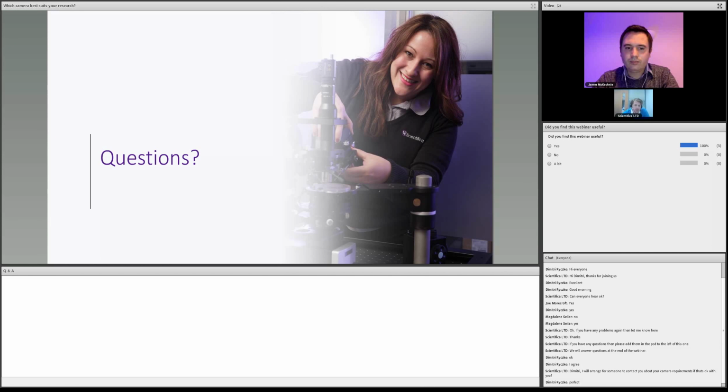Could you improve signal to noise ratio by averaging images, e.g., average every 3 images if 30 Hertz is sufficiently fast? Can you do that on camera or do you have to rely on software? So you could. The nice thing about a digital image is that you don't need to.